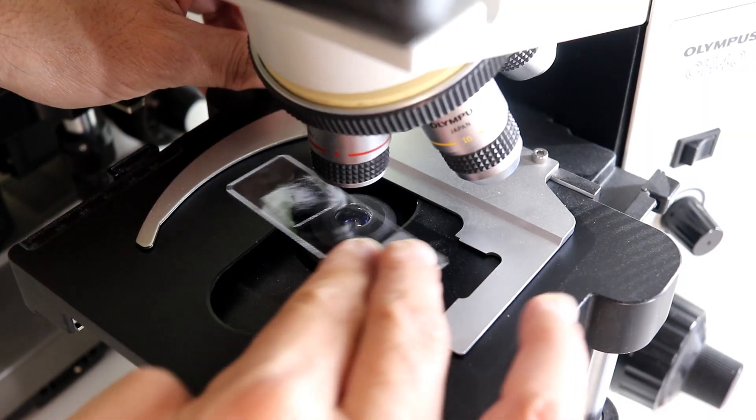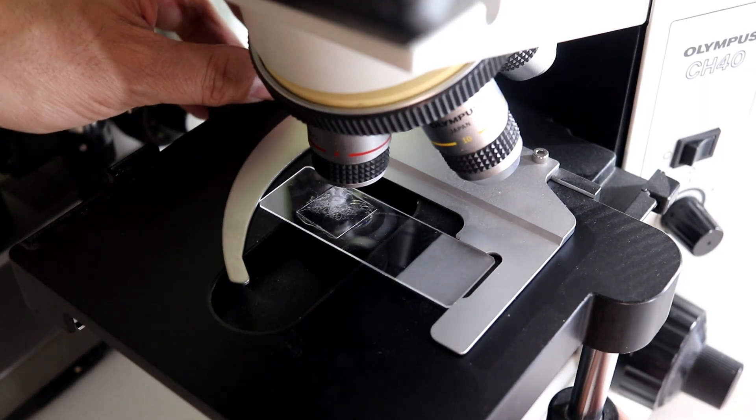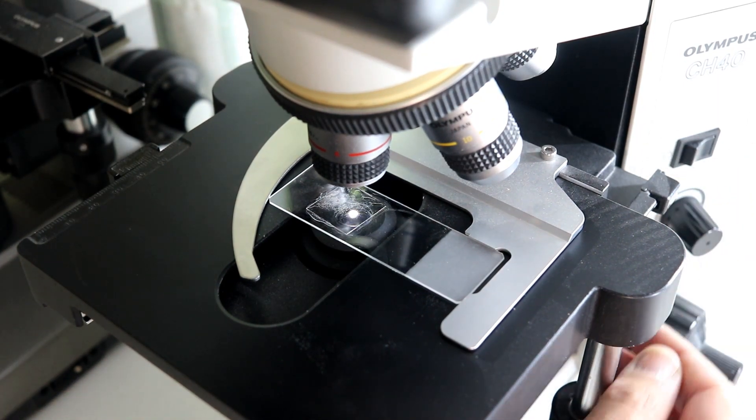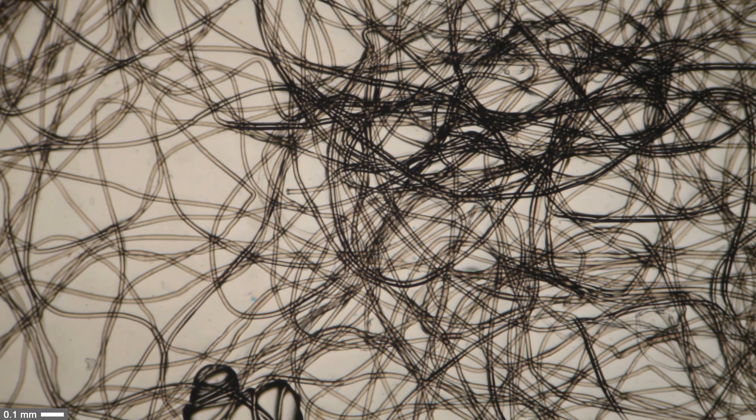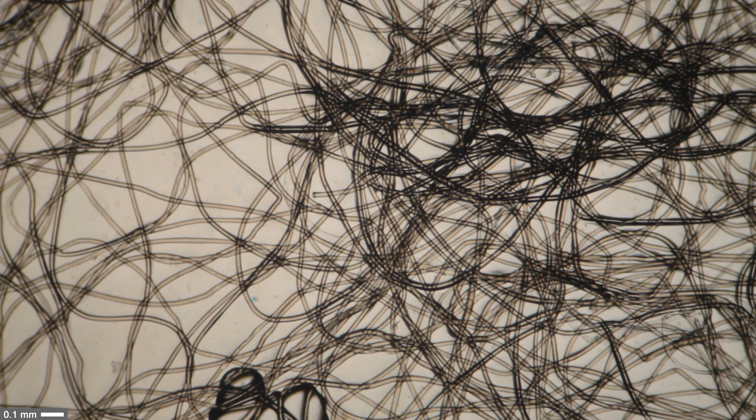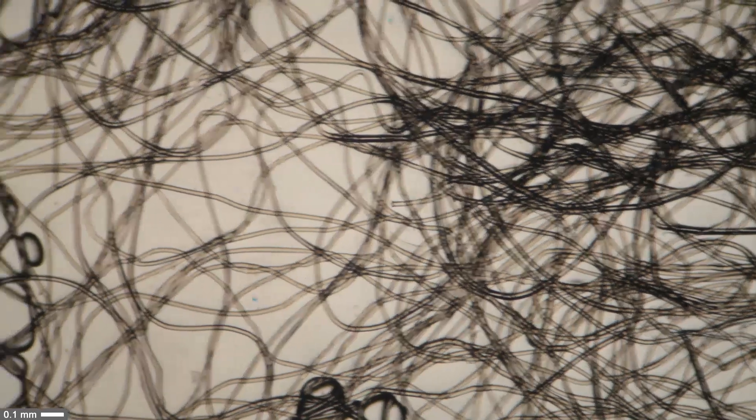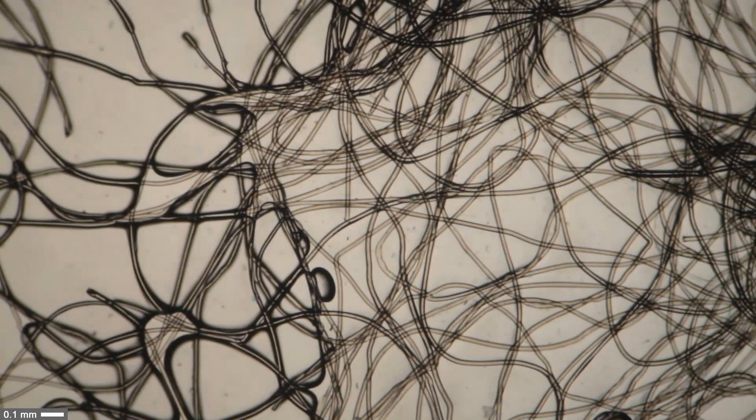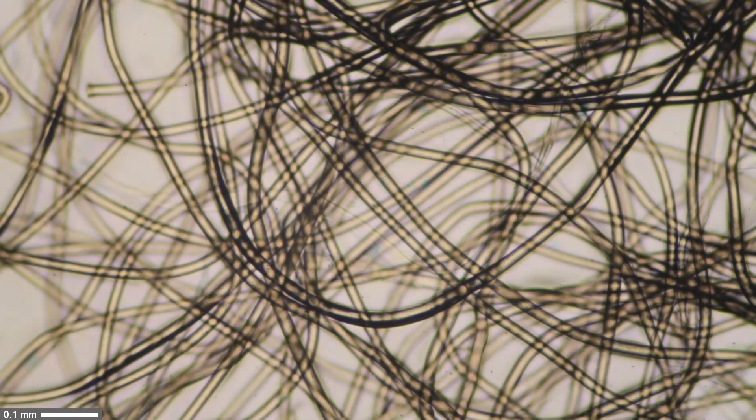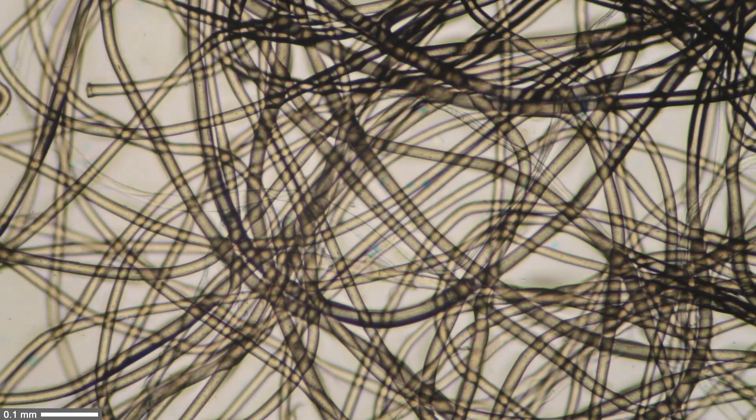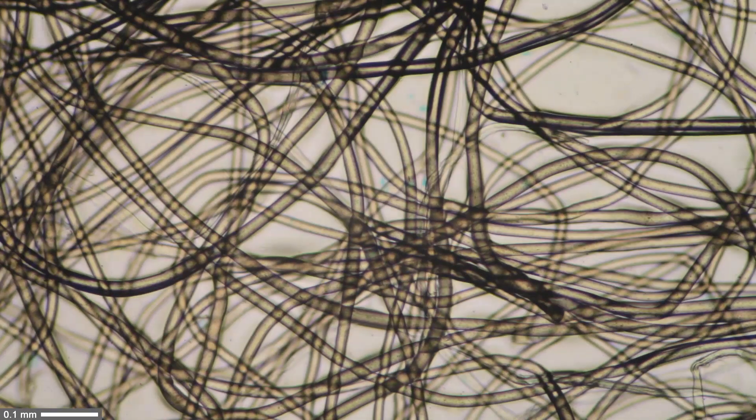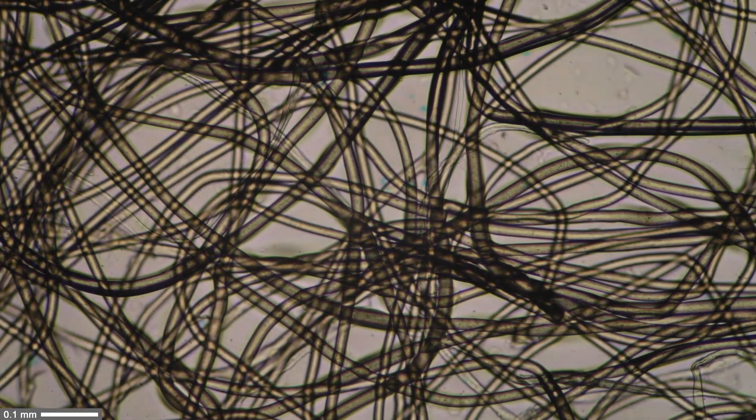Well, it did take a few days for the nail polish to dry, and we're starting with the low-power magnification objective, and this is what we see. And I'm observing this on the bright field, so you can see the individual fibers darker on bright background. And what I will be doing right now is I will be simply increasing the magnification, so we're using the 4x magnifying objective to the 10x, 20x, and up to the 40x magnifying objective. First in bright field, later in dark field.